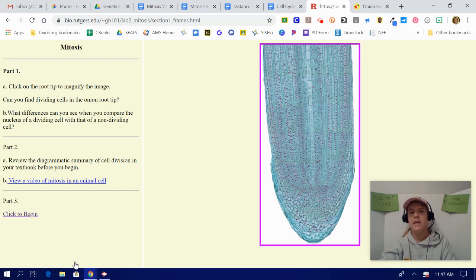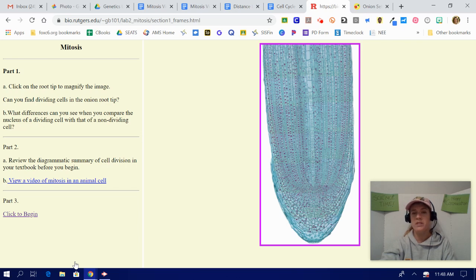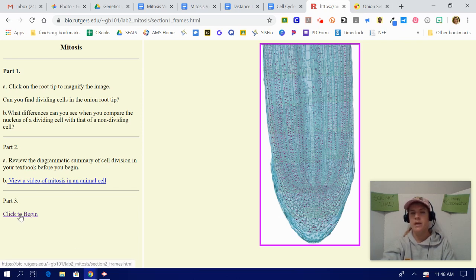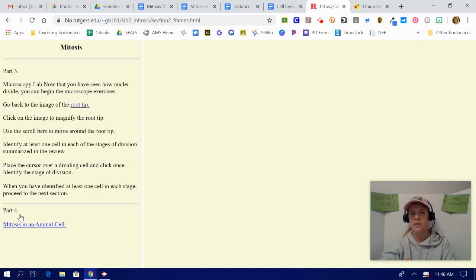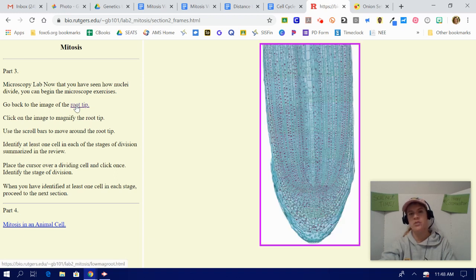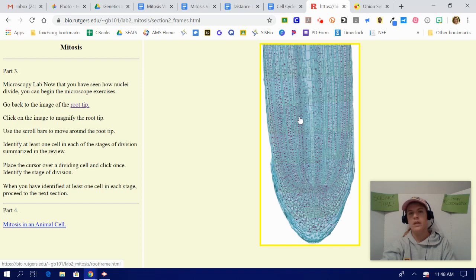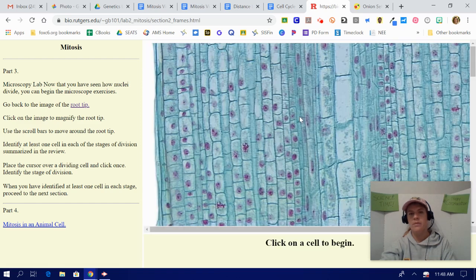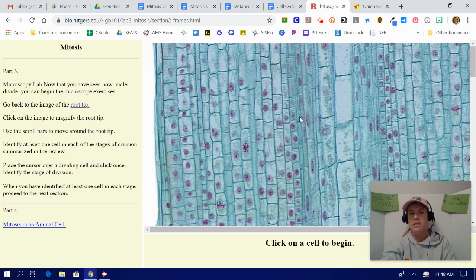Where it says begin assignment, it explains a few more directions on the left hand side, some questions that you're going to want to answer as we are going through the activities, and then click to begin. Once you click to begin, now you have to click on root tip in order to actually do the activity. Click on the image and down at the bottom, it says, click on a cell to begin.